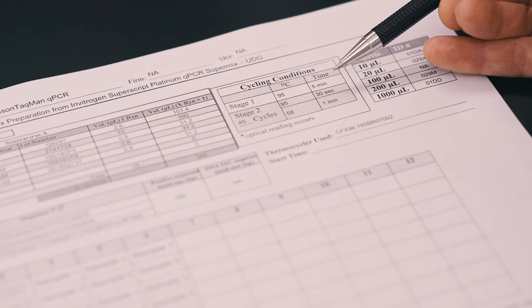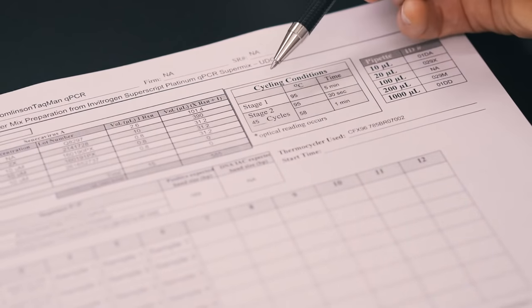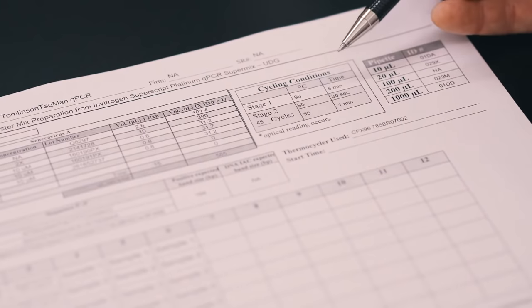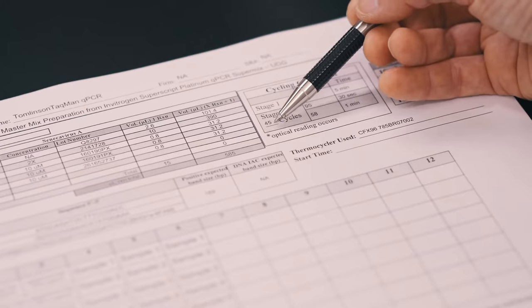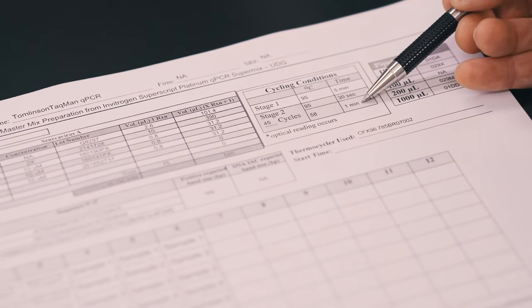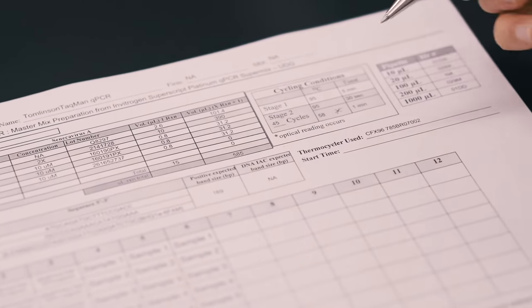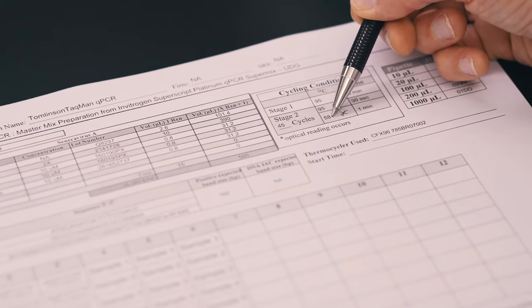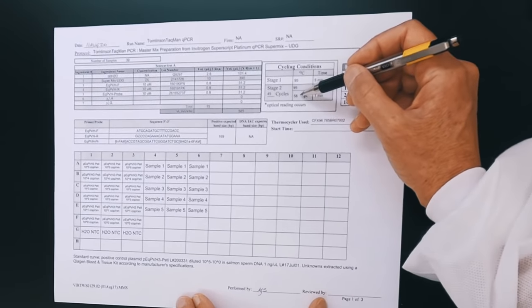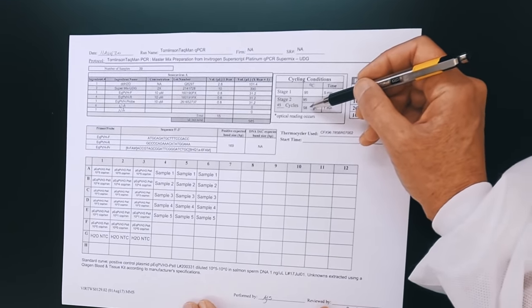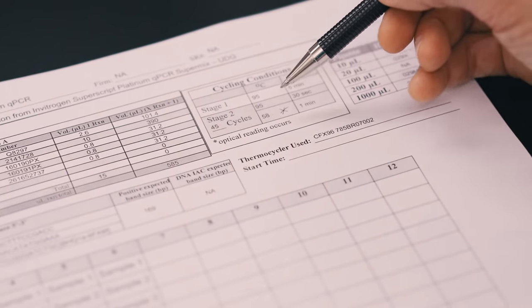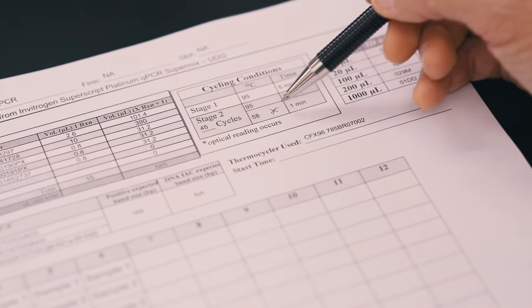The conditions for the thermal cycling are in this part of the table. Initially, we will heat the sample to 95 degrees for five minutes, and that will disassociate the double-stranded DNA. In stage two, there are 45 cycles of 95 degrees for 30 seconds, followed by 58 degrees for one minute. The optical reading occurs in this step. This is the annealing and elongation step. So as the temperature changes from 95 degrees to 58 degrees, the primers will sit down on the single-stranded DNA. The polymerase will then start to extend that single-stranded into double-stranded DNA for about a minute, and the thermocycler will take a picture of the fluorescence during this cycle.